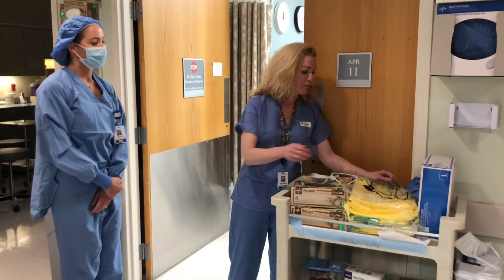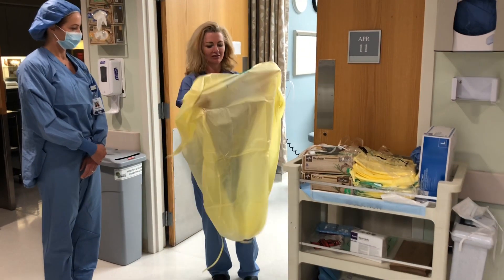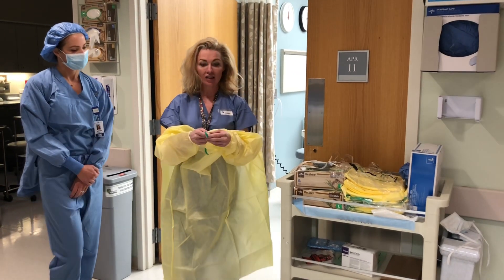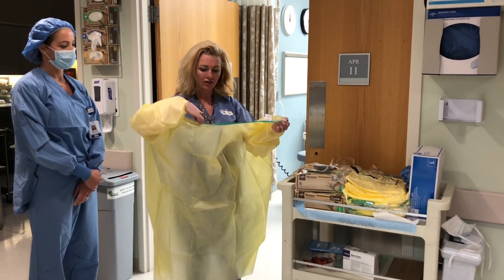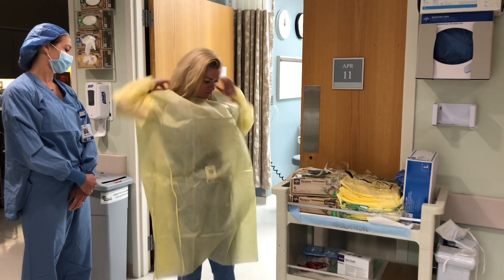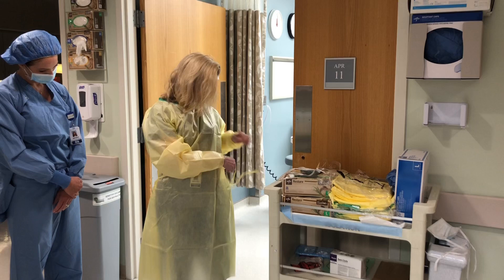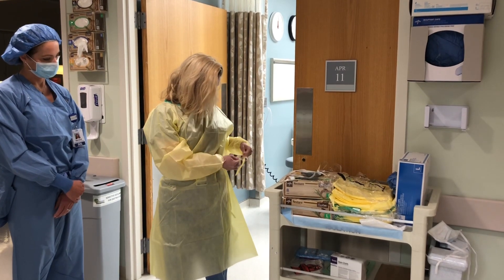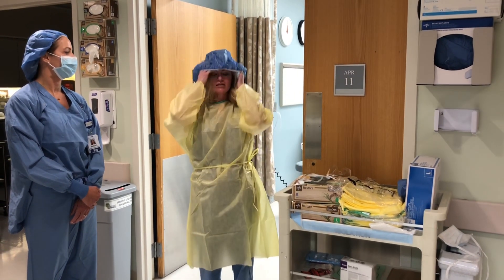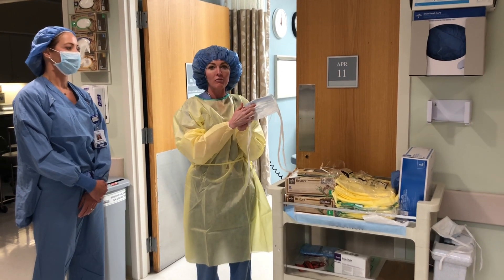So I'm going to start with putting my gown on. You want to make sure that when you put your gown on there's a little tab here — you want to make sure that that's secure. You want to make sure that the foam part, if you have a foam mask, is on the inside.